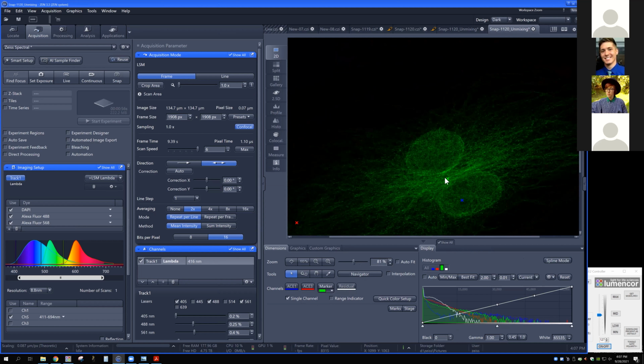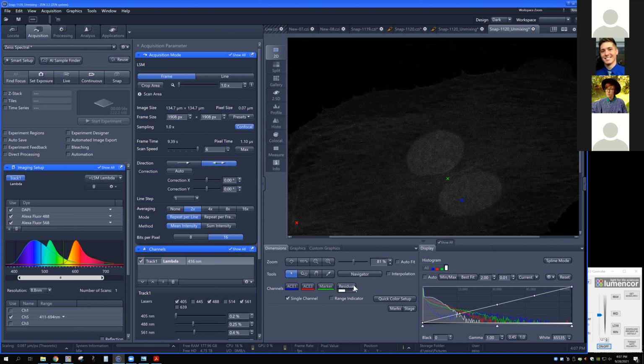Wow. Here again, even though I went completely in the middle, we're still getting some DAPI component out of this also. So there might be some background that I picked up accidentally, but with the right fingerprint, we should be able to tease it out. These samples over time too basically leak a little DAPI. It's not exactly highly bound to the DNA, so I'm not surprised if it is leaking out a little bit. And let's take a look at the residual channel as well, just to see, again, a nice blend of everything. So that looks good.